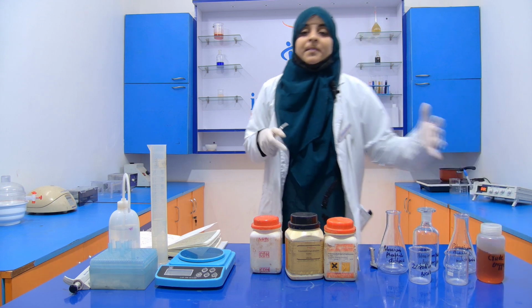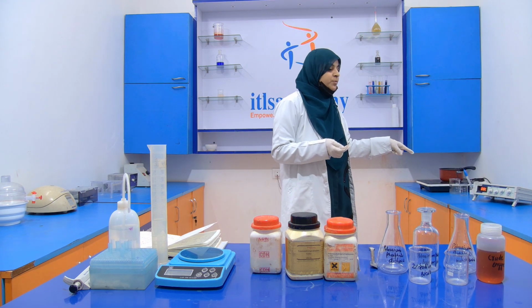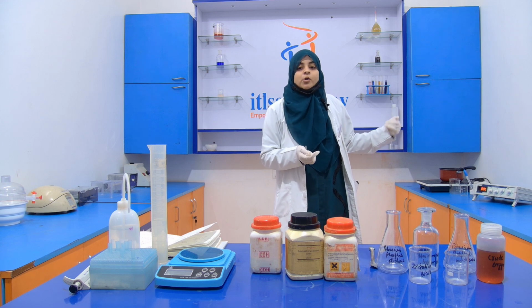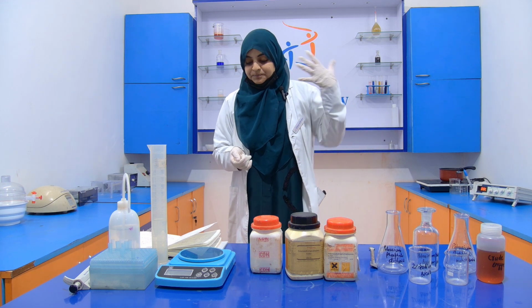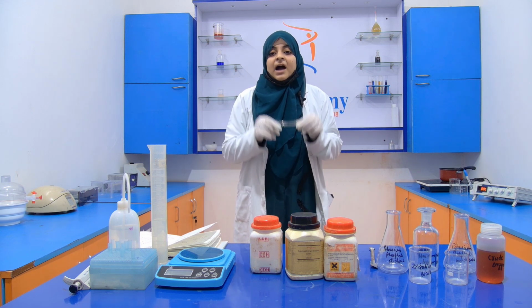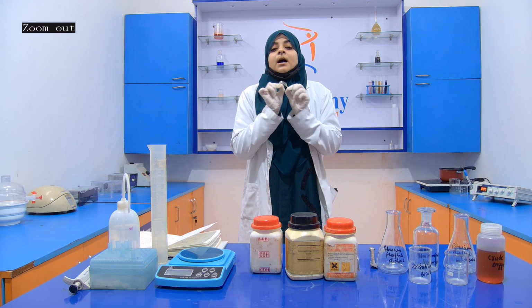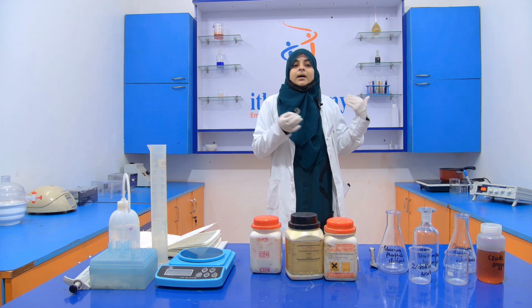The instruments that we require are simply a weighing balance and a pH meter. The pH meter is required to maintain the pH of the potassium phosphate buffer. So first of all, we have to activate this dialysis membrane, because without activation, the experiment is not possible.